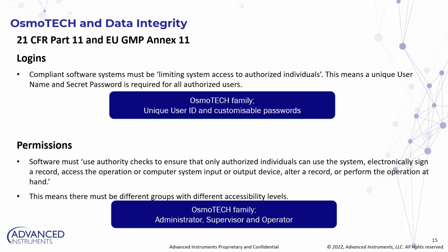The second is permissions. I used the term before when I was explaining logins: everybody can have a user ID and password on that device, but do we want everybody to have the same level of access to the data or the same ability to make changes on the instrument? Probably not, right? The people who run the test daily, we probably don't want to give them the ability to change configurations like require user ID or require sample ID, because that would make it easier for them to do the test for sure, because there are much fewer questions asked, but obviously it would take it away from being compliant.